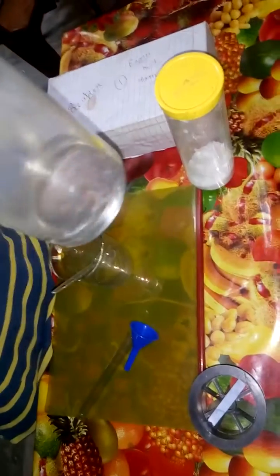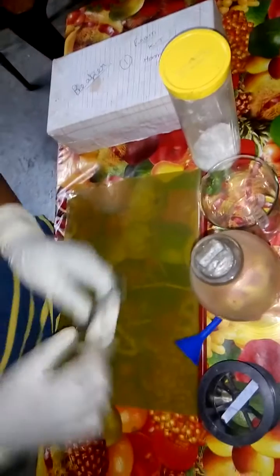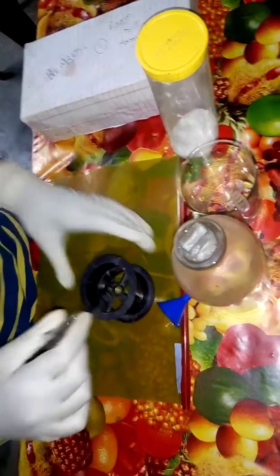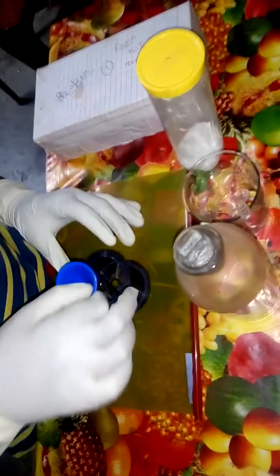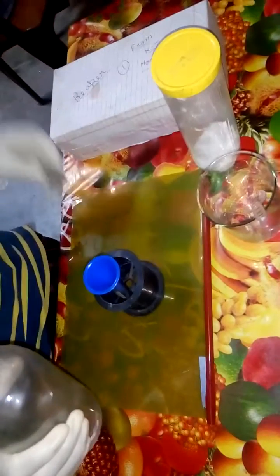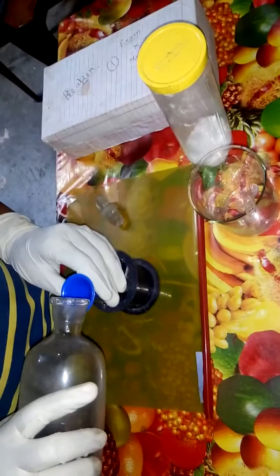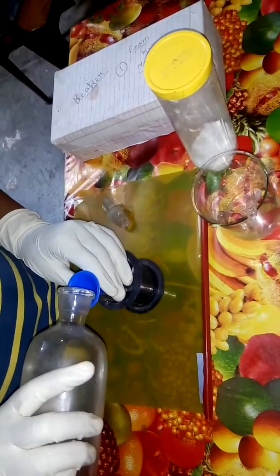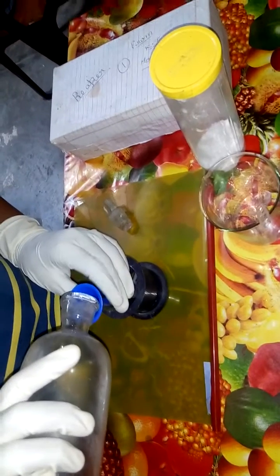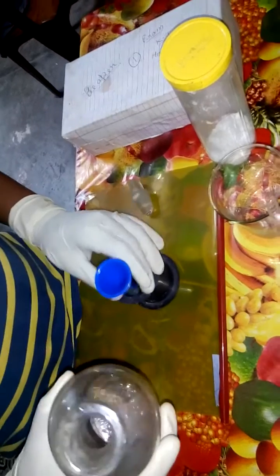Here is some sulfuric acid. You can see — now I am going to pour my sulfuric acid into the test tube. You have to be very careful because sulfuric acid is a harmful acid which can cause many types of burn. So here I am wearing my gloves. Now we have our sulfuric acid.